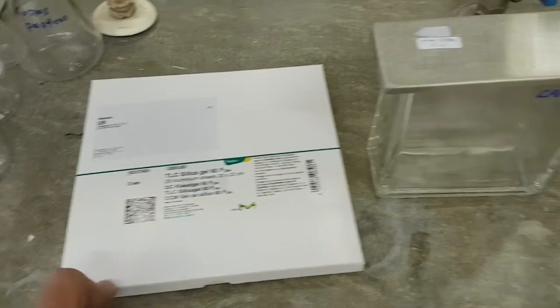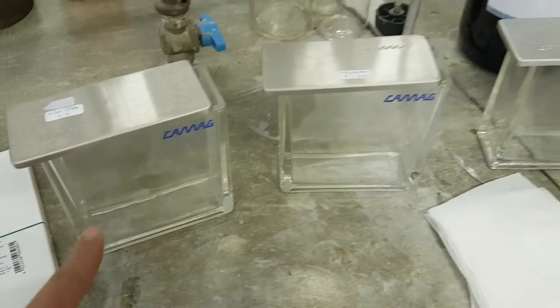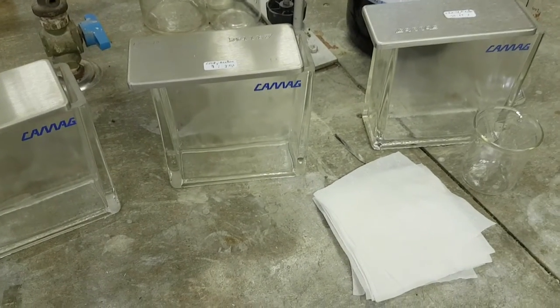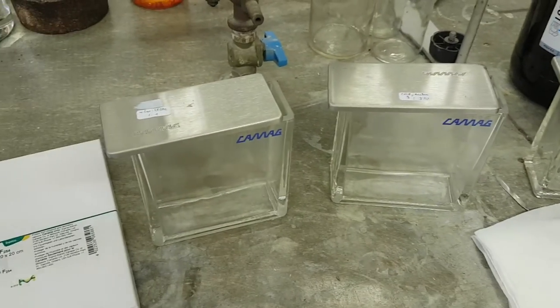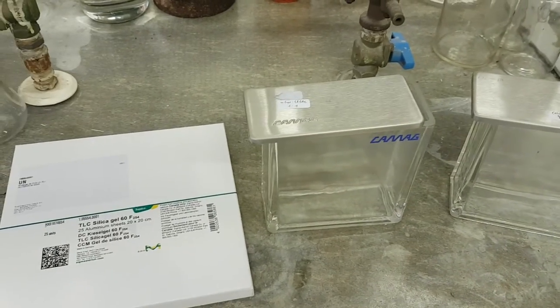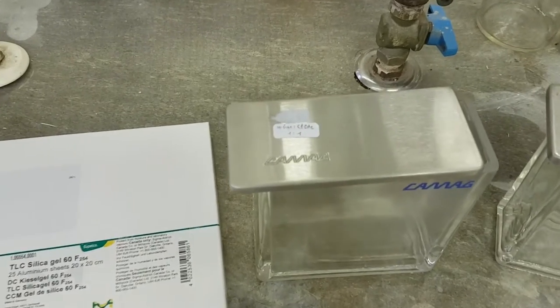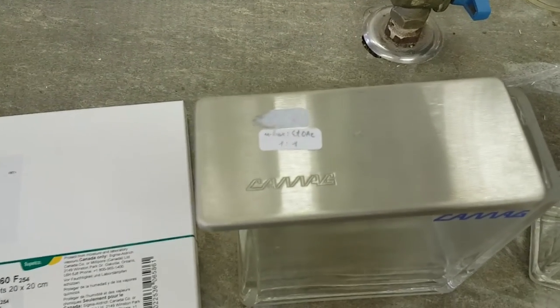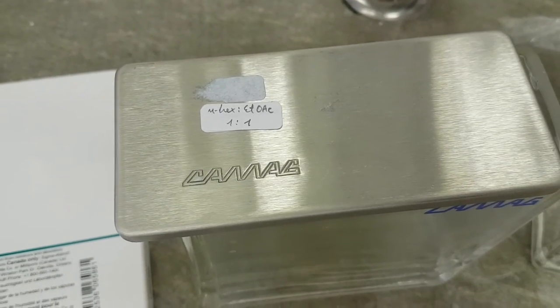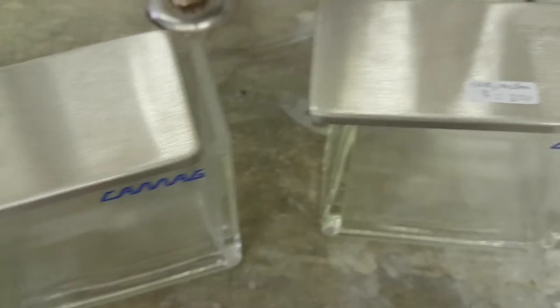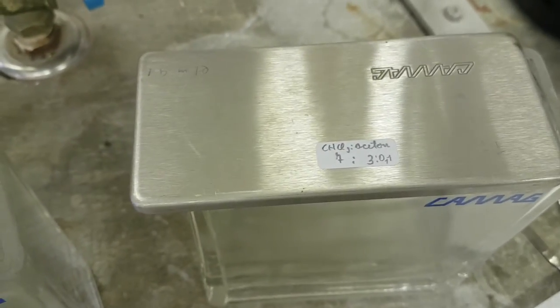Then you'll need some chambers where you will put your solvent, and you need to try different ratios of solvent. For example, here we made hexane ethyl acetate 1:1, which means 50% 50%.